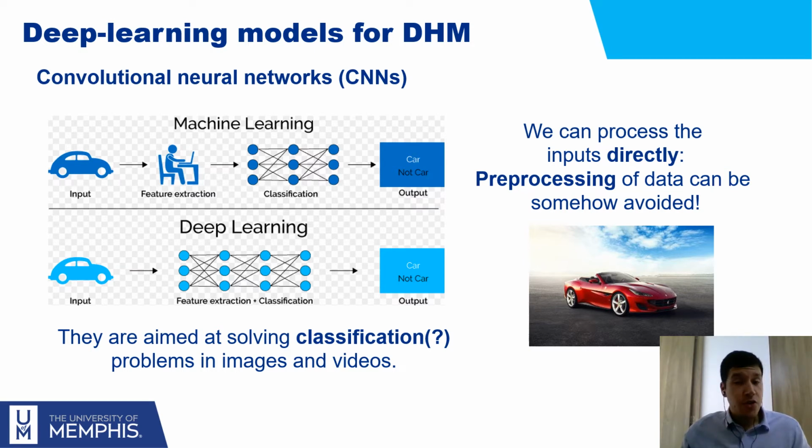I mean, usually when you code a machine learning algorithm, you will need to pre-process the images that are input to a system. Then you can have the classification or regression model do some given task. But with this kind of model, you can avoid this pre-processing because the main features of the information present in the image are gathered, abstracted, by these layers.